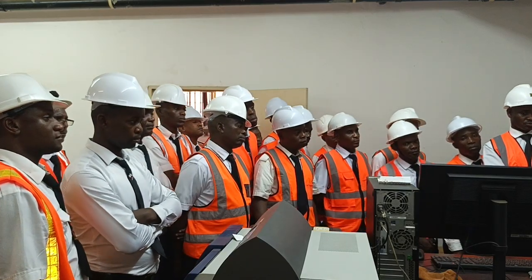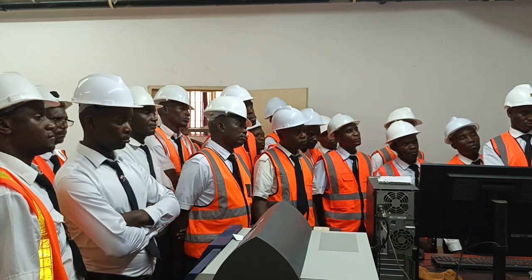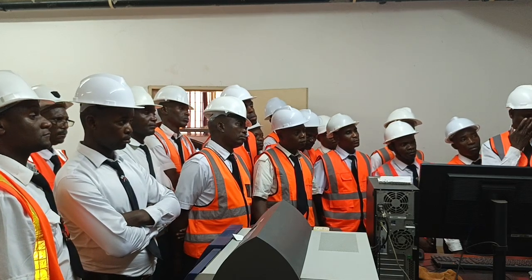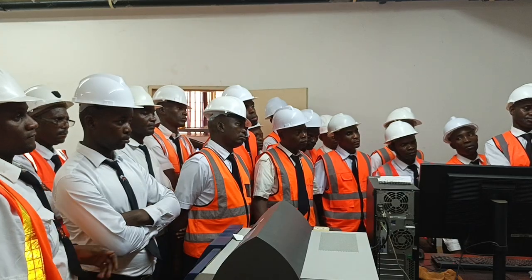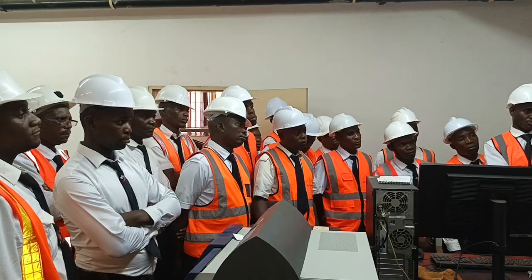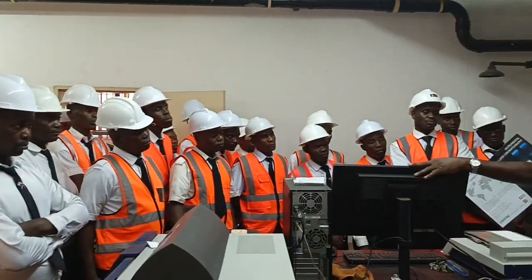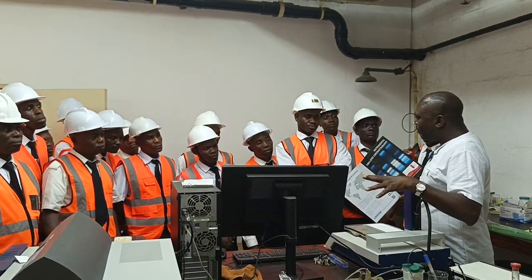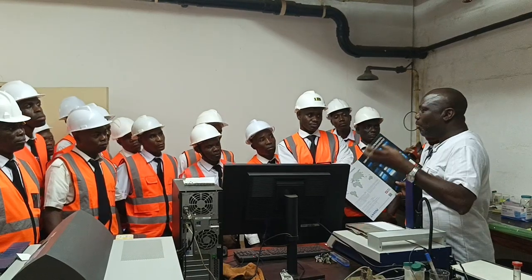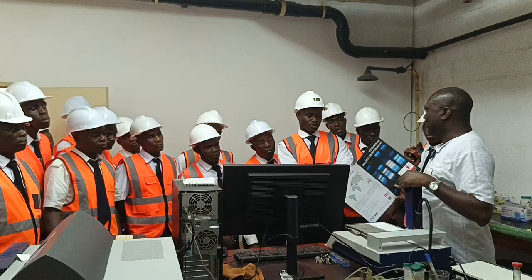So when you see it like this, we take this plate, which is the one here. Imagine this one is this. Taking it into the machine here. Now this machine will be able to read individually all these separations onto the computer, and then even give you the name and also the quantity of how much is present in that sample.